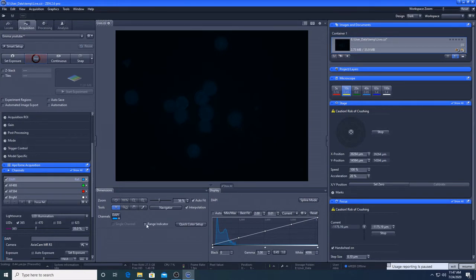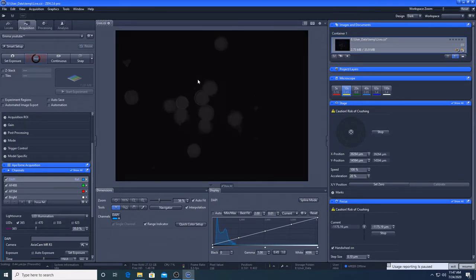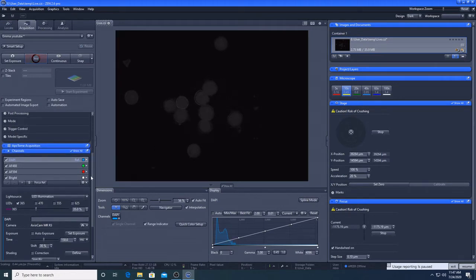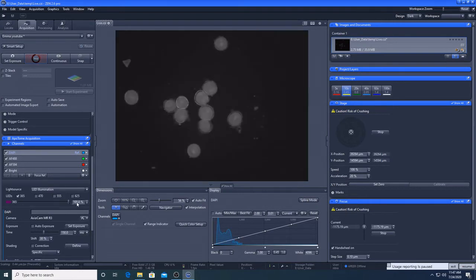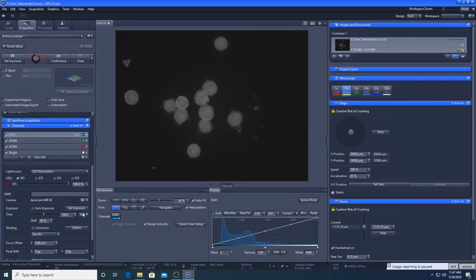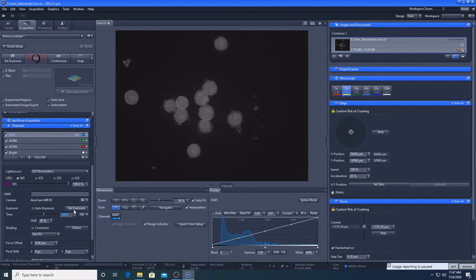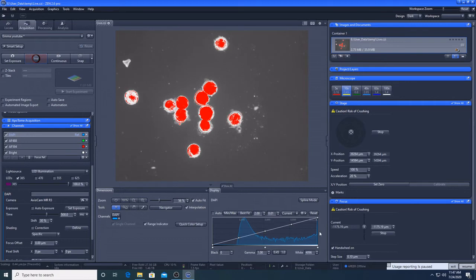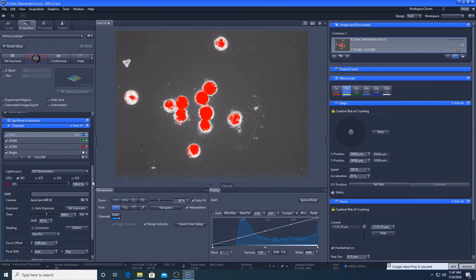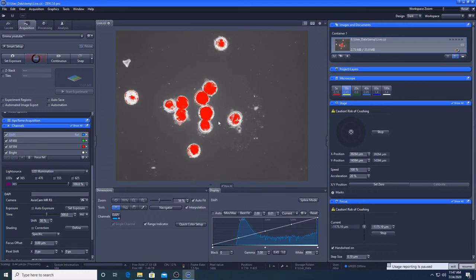We can use range indicator to show underexposed areas in blue and overexposed areas in red. At the moment everything is within a measurable range, so the image in the live window is completely monochrome. If I increase the light intensity here to 100% and the exposure time by typing in the time in milliseconds and hitting enter, we now have some overexposed areas. This means we have lost structural details about our sample, and this image would be unusable for intensity comparisons because the intensity readings have gone off the chart. Our sample is also at a higher risk of bleaching.